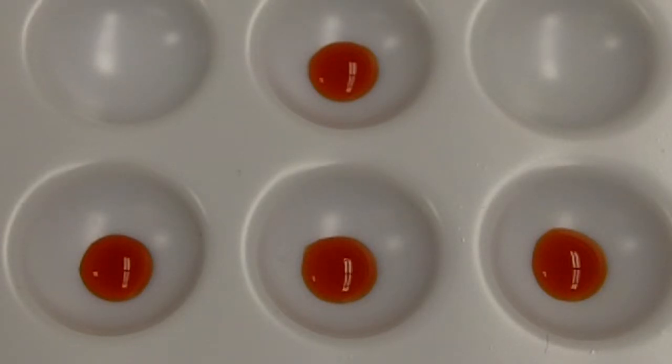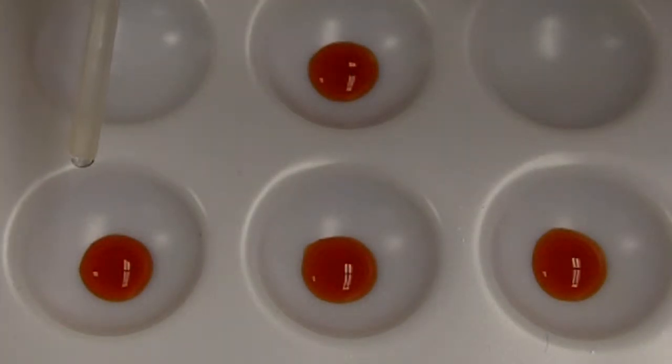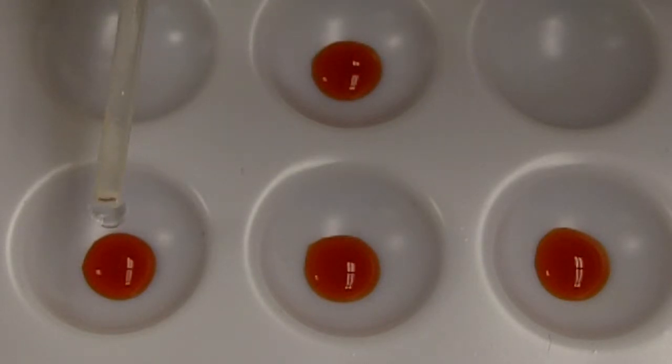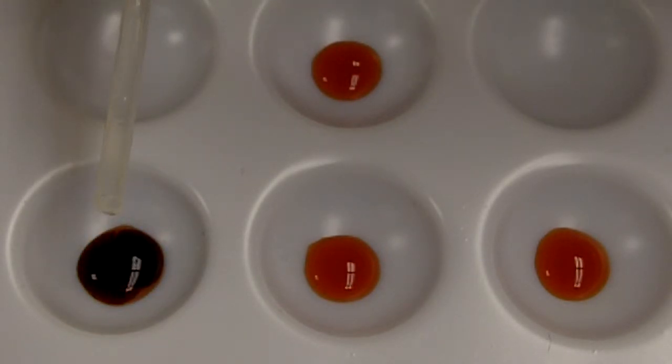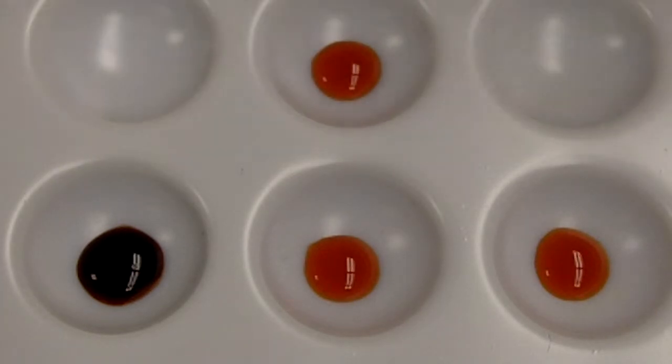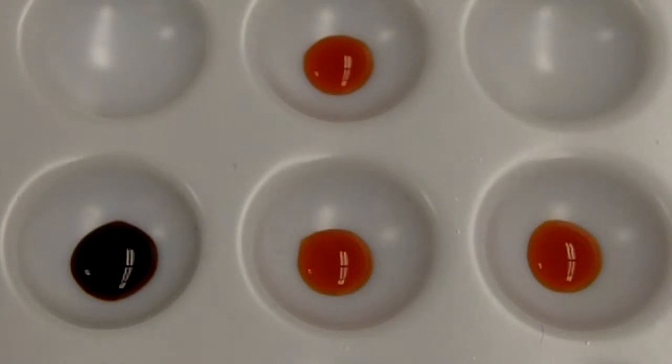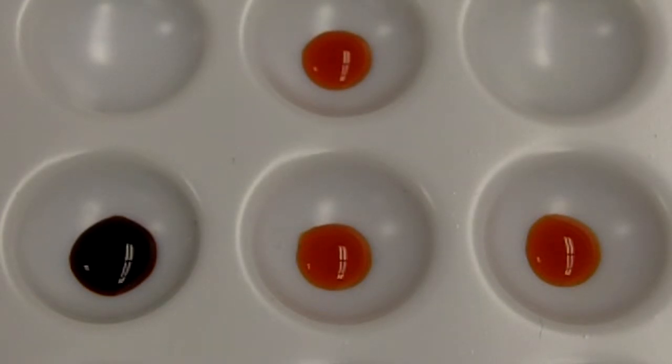To well number 1, we're going to add KSCN, and it's the SCN- that's a part of the actual equilibrium, and of course the shift change will result from that. So this is the adding SCN-. Noting that it looks like the color of that got much darker, almost looking black in the video. Here in real life, it looks like a deep blood red color, almost black.